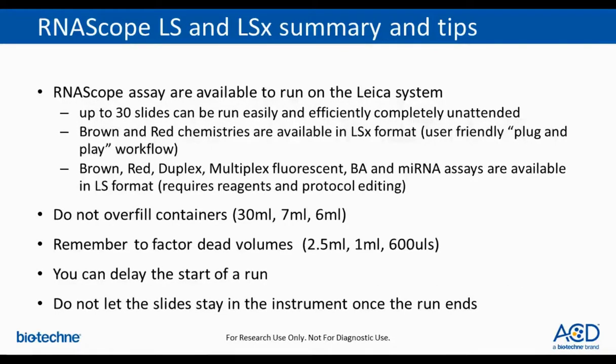An important thing to know about the Leica system is that you can delay the start of a run, so you can have it finish at whatever time and day you want. We do recommend, however, that when it's finished, you take the slides out and coverslip them as soon as possible, because you don't want to lose your counterstain. And this is pretty much it.